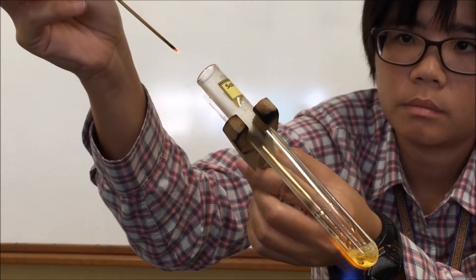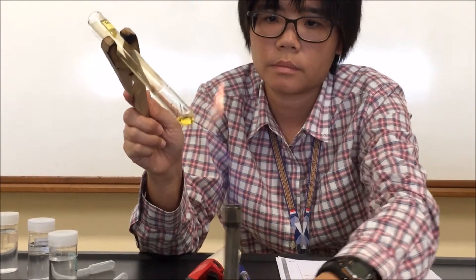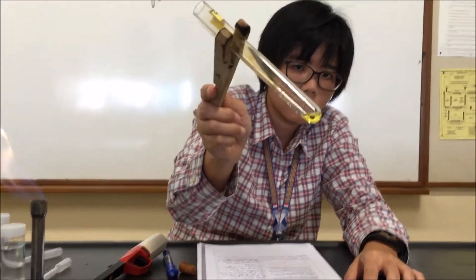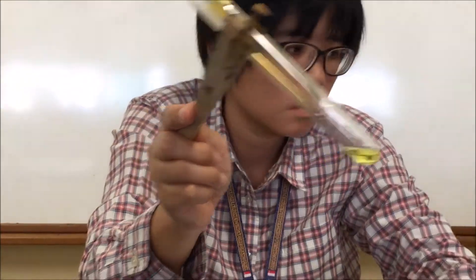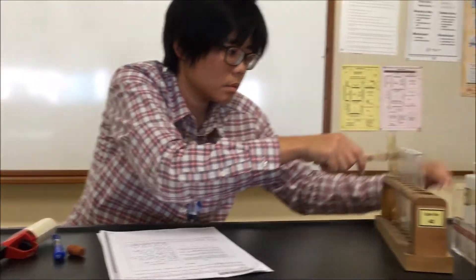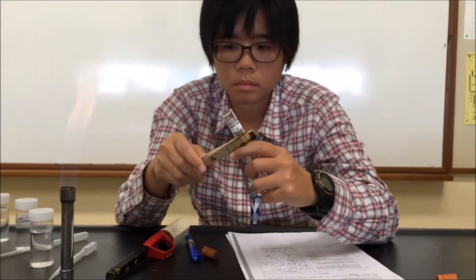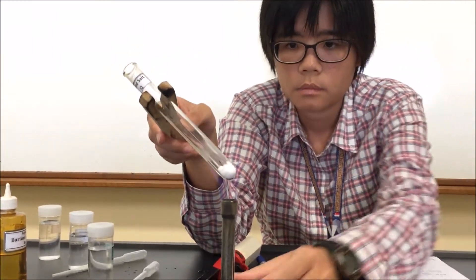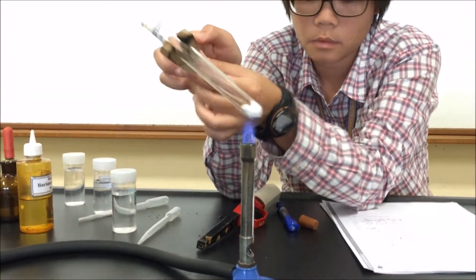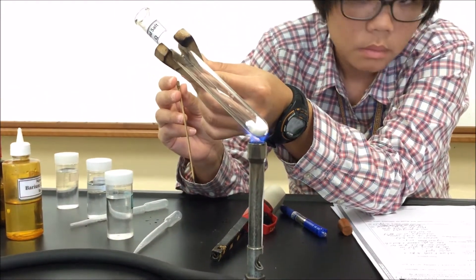Next we move on to solid salt cube in another test tube. We will repeat the experiment — we will heat it first gently and then more strongly. All the while we will be placing the test tube at the tip of the small blue triangle, the hottest part. Similarly, as we do the glowing splint test, we pay attention to the changes going on in the tube. This time we do not see water droplets; we see white fumes appearing.